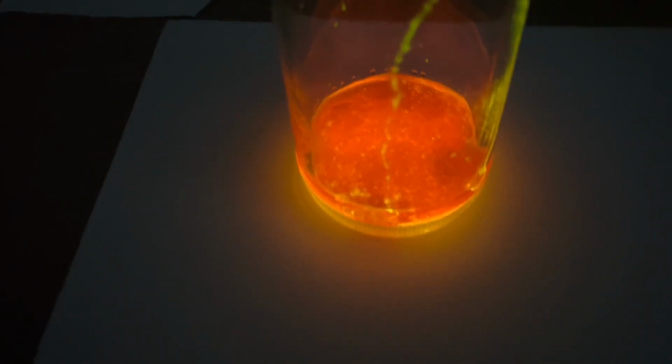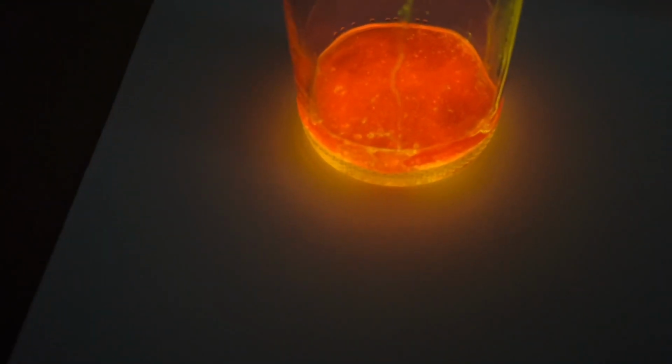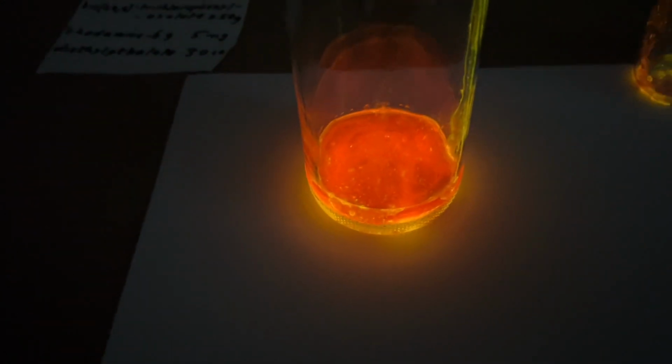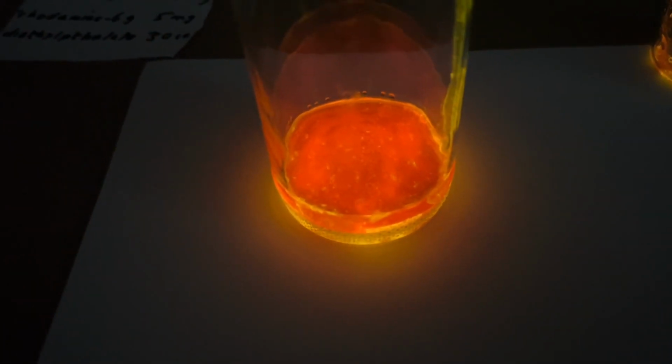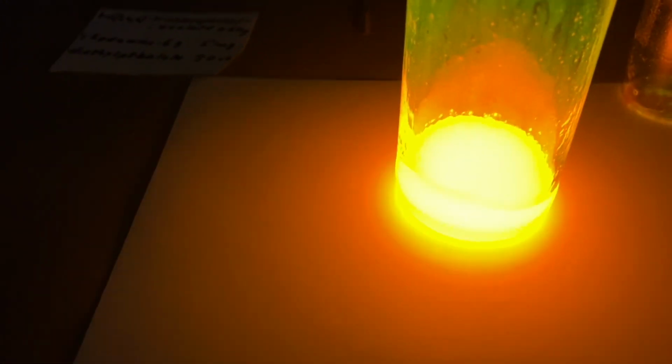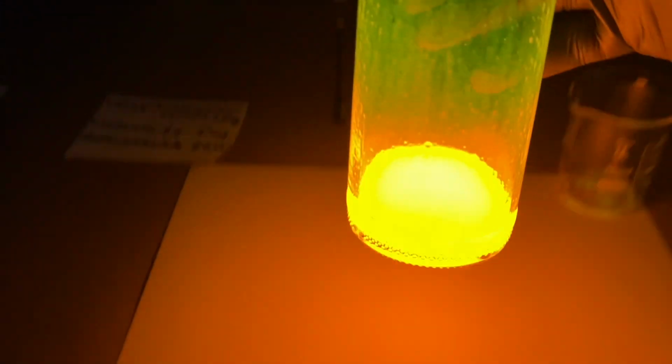The solvent also affects it too. So with the diethyl phthalate, the glow lasts longer, but you can also do it with ethyl acetate, and I think it's probably just as good, if not. Now I'm going to shake it up, and you should see it really turn bright as the reaction proceeds. There it goes. I can actually see with this. It's like a glow stick, or it's like one of those emergency lights that you get, chemical lights. But that's bright enough to see by.